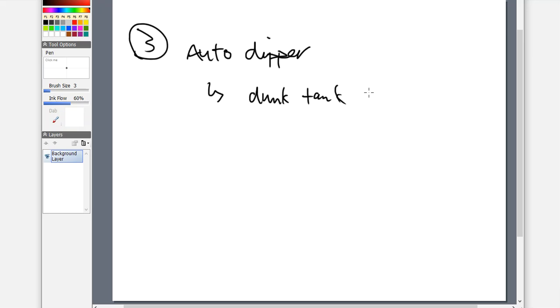And it does that in one fell swoop motion, where I am making everything universal. I'm making sure that the exposure here is going to be very smooth. And I'm not klutzy with my own hands, dipping it down in there, knocking it up against the sides of the development tank, scratching the surface of the silica, especially if you're a very nervous person. So an auto dipper is going to be another way that we can image or help apply the derivatizing agent for that image to take place.